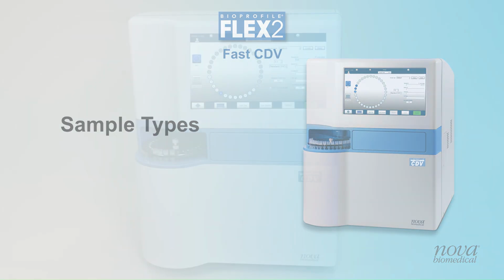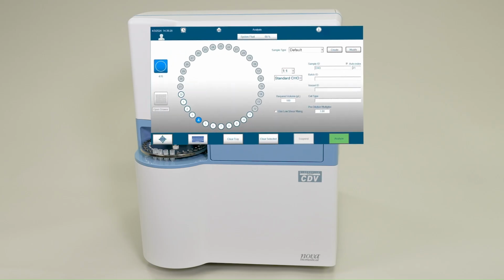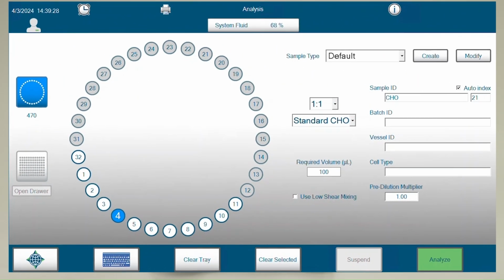One of the key features of the FAST CDV is the Sample Types function, which allows an operator to create customized, pre-configured sample types for each cell line, media type, or sample type. Sample types can be created or modified from within the analysis screen. When a sample type is created, all an operator needs to do is select the applicable sample type for the sample they are running, and the sample configuration will automatically be loaded.